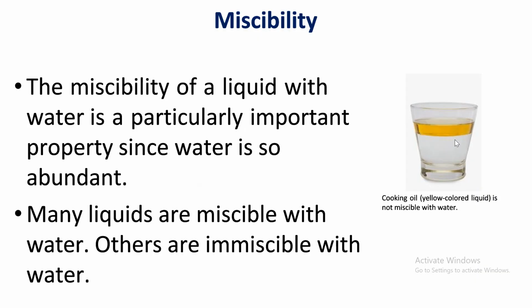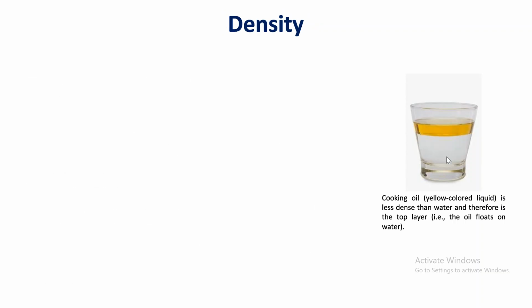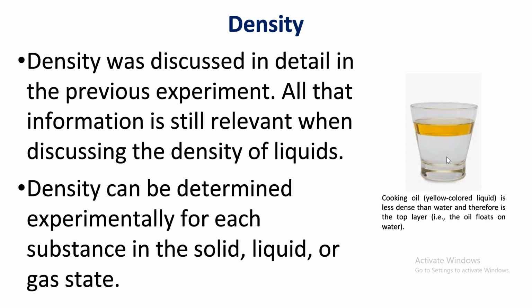So that's why we care a lot about water. Now, many liquids are miscible with water, but as we just saw, other liquids are not, like oil will not mix with water. Let's talk about density and see if we can figure out a relationship between density and miscibility. We discussed density in an earlier lab video in a previous experiment, and we are going to talk about it today in relation to miscibility.